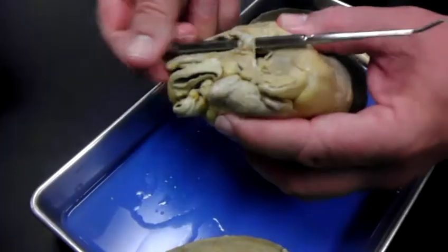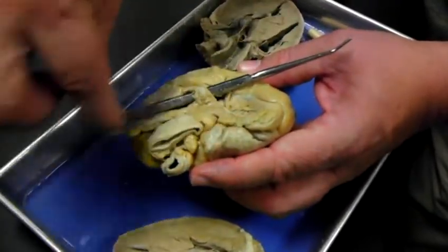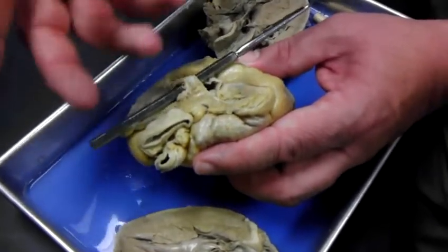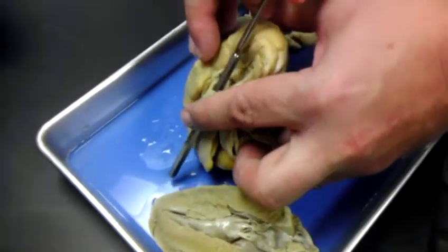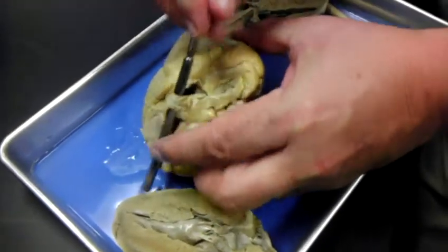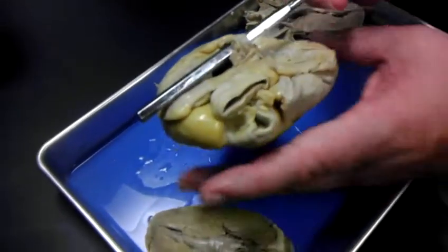Now, when they remove the heart, there would be a blood vessel coming in, attaching to that hole. That would be the equivalent of our superior vena cava, the pre cava. Same thing here. See this hole back here? There would be a blood vessel coming in, attaching to that, emptying into the right atrium. That would be the equivalent of our inferior vena cava, or the post cava.